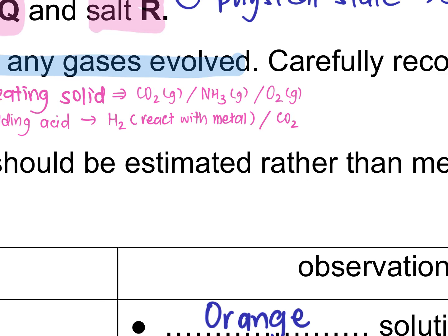Okay, then third, you have boiling tube, you have test tube. Remember that day you used the stopper that's of two different sizes? The delivery tube has two different sizes, right? If you are using a test tube, then you should be using the stopper that is smaller in size. If you are given a boiling tube, then use the delivery tube with the bigger stopper. So these are things you need to take note of. Don't go and use a small stopper to stopper your boiling tube. By the time you do that, all your gas escapes already. So that part you will fail.